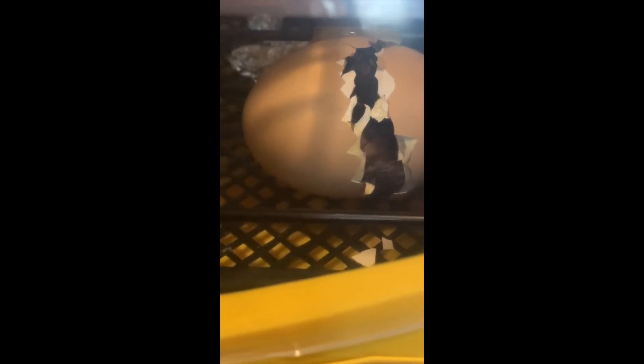After about 21 days the chicks start to hatch, and even with that window in there I normally don't have any issues with it — they're able to cut all the way around and get themselves out of this particular egg.